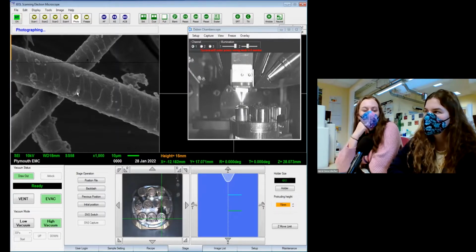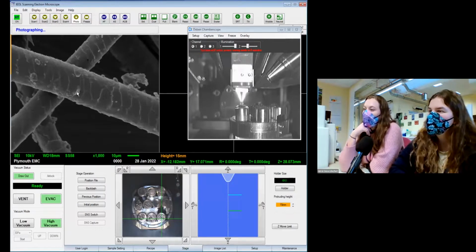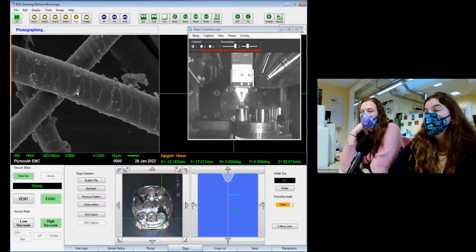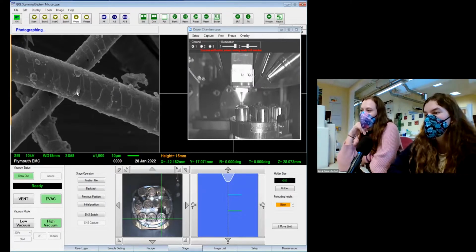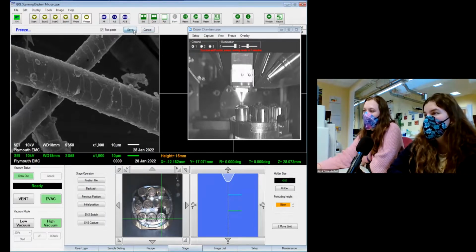I expected it to be more with the tulipy, platey bits. I guess because it's their outer coat as well, and tigers like swimming, so they probably want to be somewhat weather resistant. This is true. Wanda hates water as well, so that makes sense. See if the cat still had their tiger hair, they'd be fine. I wonder how different cat hair is between different cat breeds. I don't know. That's a good question. Cosmo and Wanda are tabby cats. But tiger one.